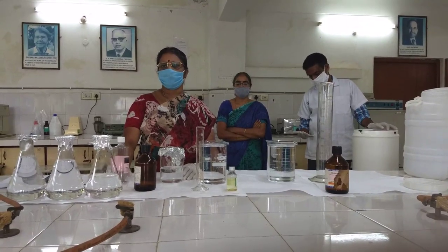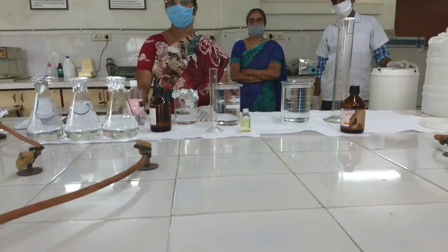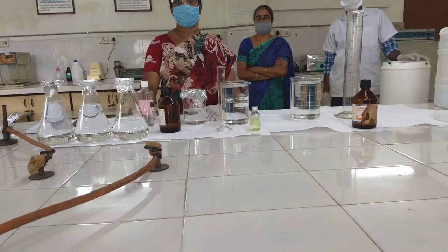A few drops of an essential oil, eucalyptus oil, are also being added to this sanitizer to give fragrance. We are now preparing 10 liters of the hand sanitizer.